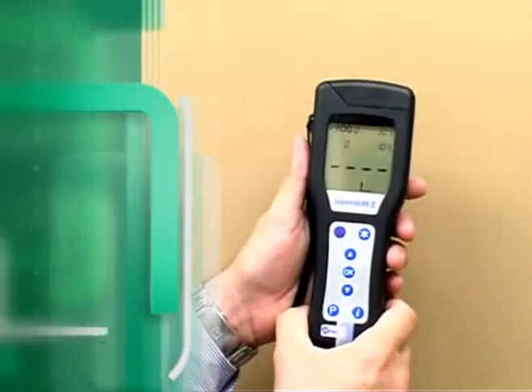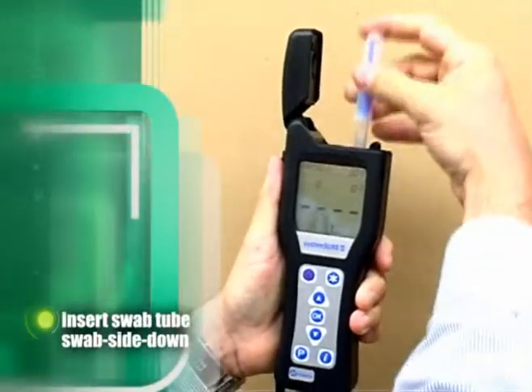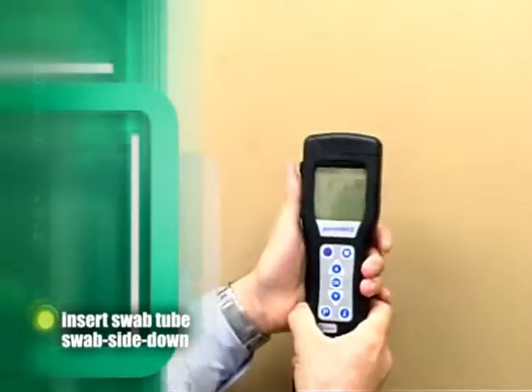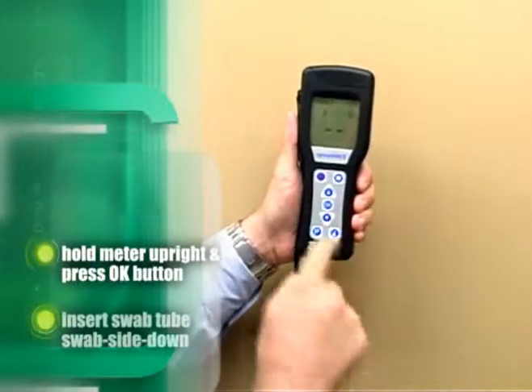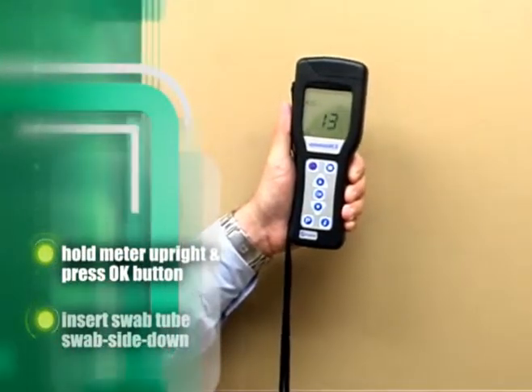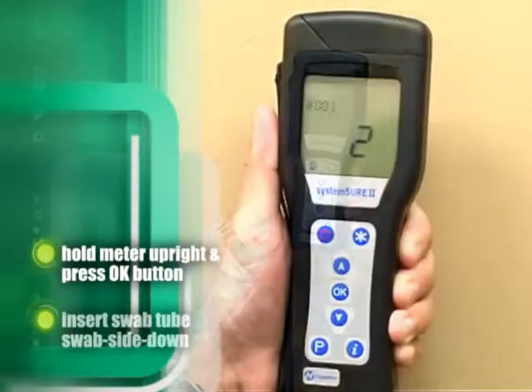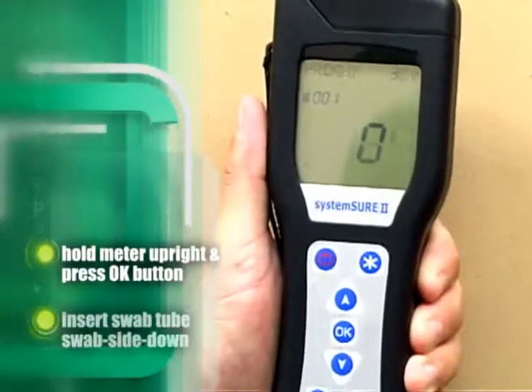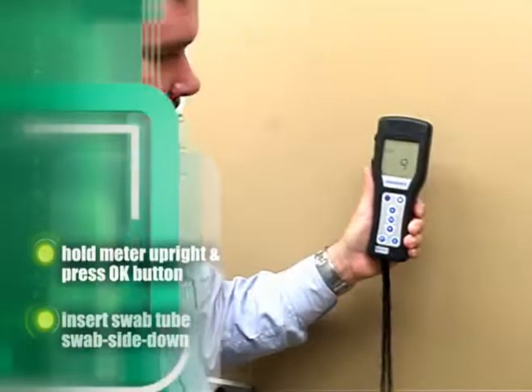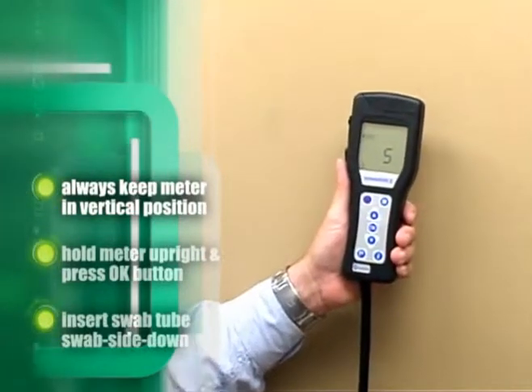Within 60 seconds of activating the swab, open the top of the meter, insert swab tube swab side down, and close the lid. Hold the ATP meter in an upright position and immediately press the OK button. The meter's LCD screen will count down from 15 seconds and will then display the ATP reading. When taking a reading, it is important to keep the meter in a vertical position to ensure the liquid reagent is at the bottom of the swab tube.